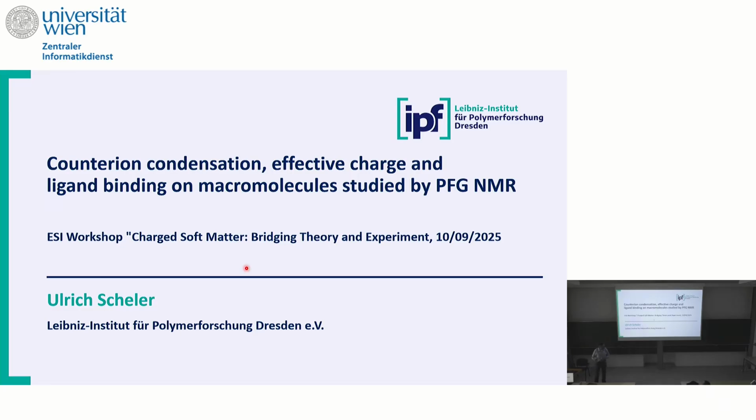I will talk about NMR, as you might expect. NMR mostly, but I took the liberty to insert one topic. Okay, simple thing, I'm talking about just polyelectrolytes in solution only.